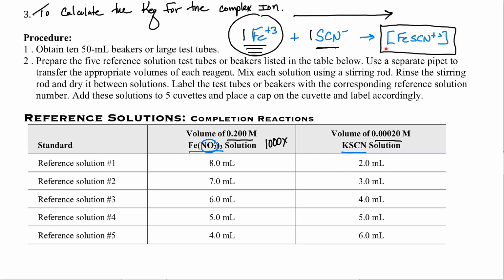This is going to go to completion. So we're going to be able to figure out the concentration. See, we want to build a Beer's law graph that we can clearly understand, so that we can know the molarity of this colored solution and then plot a curve.